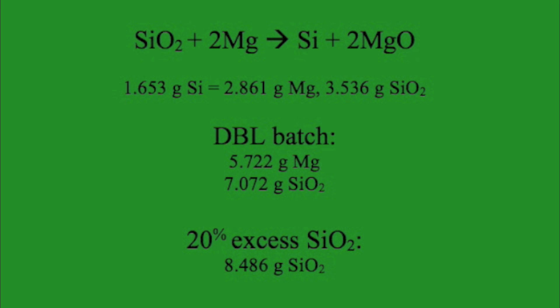I decided to do a double batch because I was expecting low yields. This brings the mass up to 5.722 grams of magnesium and 7.072 grams of silicon dioxide.